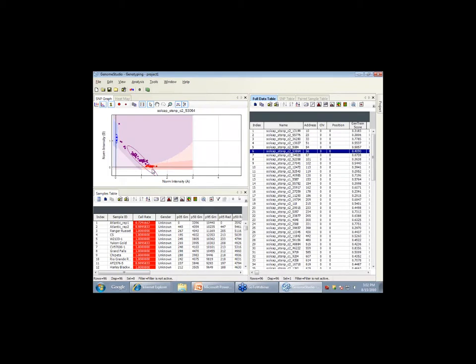Just to give a little background, we have 96 SNPs here that we're interrogating, and we're able to call 5 clusters using our software, which I'll show you, in 56% of the data points. So 55 data points, we actually saw 5 clusters that we could make sense of. And we saw 4 clusters in about another 25% of those data points. Just to give an idea of the sensitivity of the Illumina assays, at least for this set of data points. So for over half of the data points, we're able to see basically the 5 genotypes that we expect.